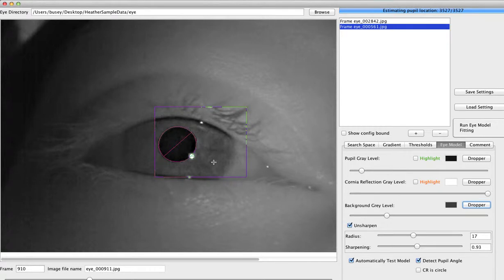Now this, by the way, is the specific reason that we designed the forward eye model. You can see that the corneal reflection is taking a bite out of our pupil, and that's something that if you just did an ellipse finding routine, it would have difficulty with. What we basically do is a forward eye model where we paint the entire image gray, the same gray level as the outside of the pupil, and then we draw an ellipse in this region and a white circle here, and we minimize the parameters of these different locations of different objects to try to find the best match between our forward eye model and the actual image. And this is doing a very nice job of capturing that, so I'm going to add that as a third parameter set.